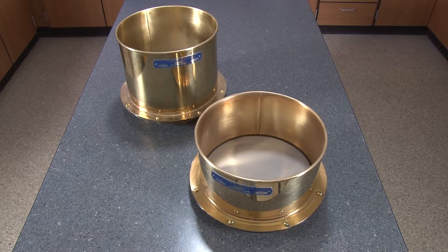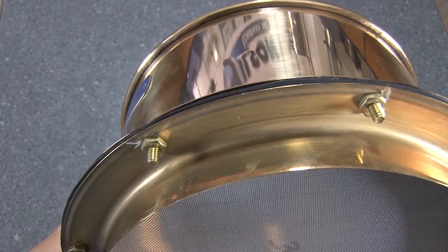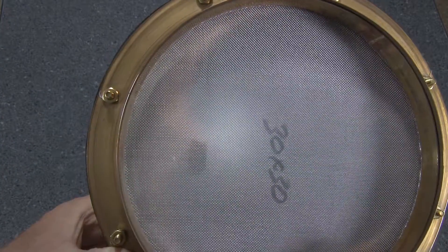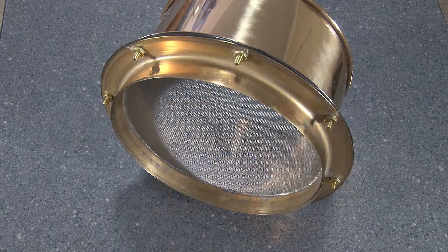Replaceable mesh brass framed wet wash sieves are 8 inches in diameter with either 4 or 6 inch frame depths, and with screen assemblies that can be replaced quickly when the wire cloth is worn beyond acceptable limits. The unique cartridge assembly comes with either a number 200 or 325 ASTM E11 stainless steel wire cloth, and each cartridge includes a number 35 stainless steel backing cloth for reinforcement.